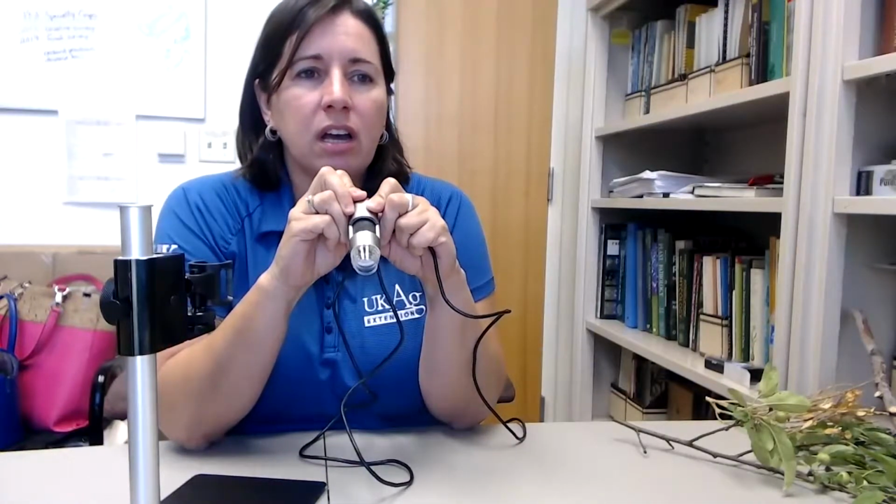Okay, yeah, Adam Leonberger is a real plant pathologist, so he's got the good scopes. If you have a microscope, you're probably not going to use a Dino Light. One cool thing about Dino Lights is you USB, it shows up on your computer, and then you can share. But you can share, because this is USB, you can share your screen with me and we can have discussions, and you can't do that with a microscope.